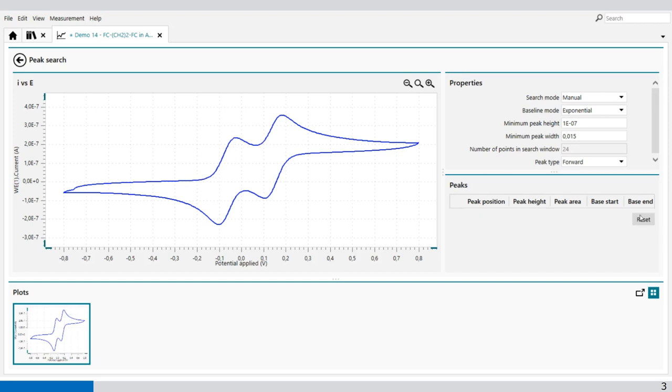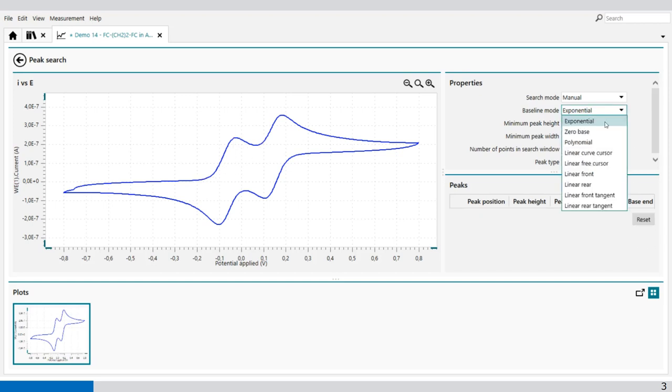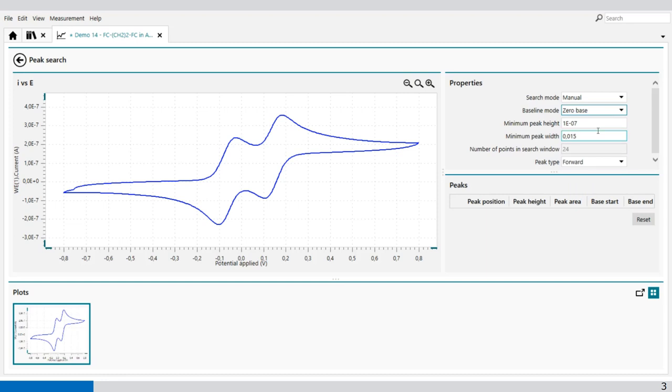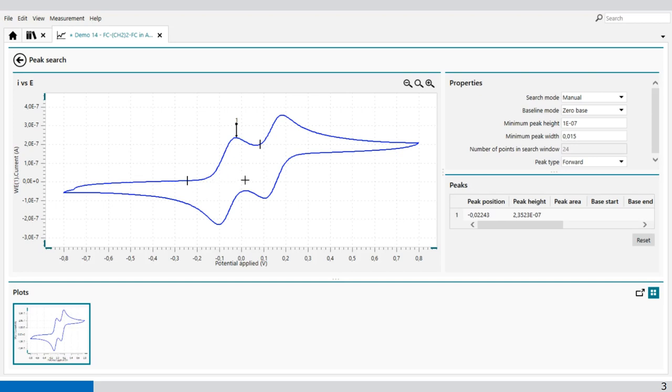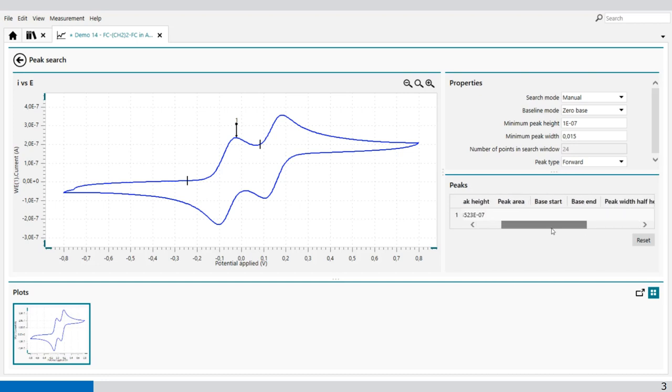You can reset it and change it to another baseline mode. For example, zero base. With zero base, you select two points on the graph, and it will use the maximum value which you find as a peak. So it uses the peak height and peak position. It doesn't give you a peak area or base. It only gives you the peak position and the peak height.